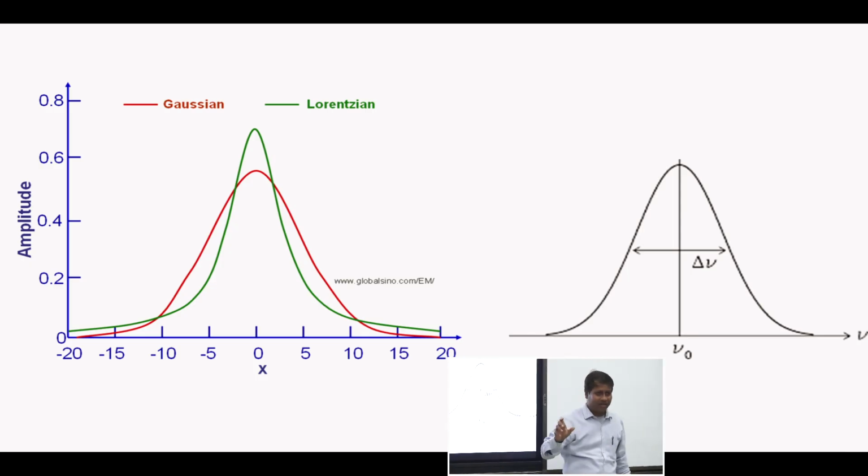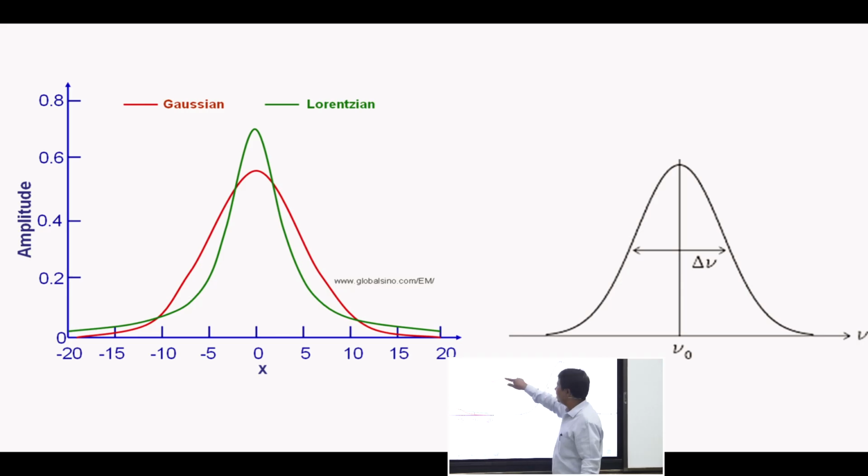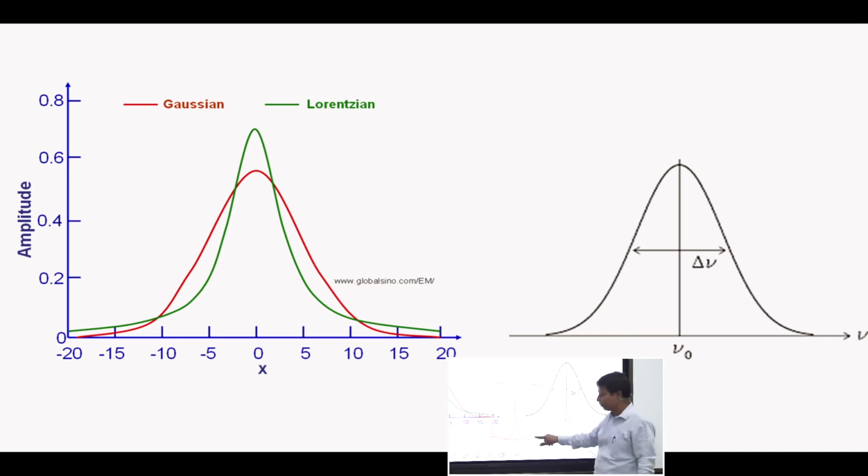So what are the factors which contribute to the intensity? Whether you will see a weak or a strong, a narrow or a wide band. There are two things. One is the intensity and two is the width. Width means this is the width.